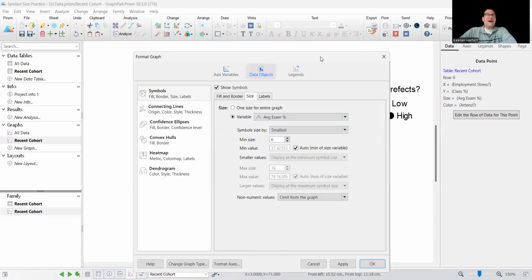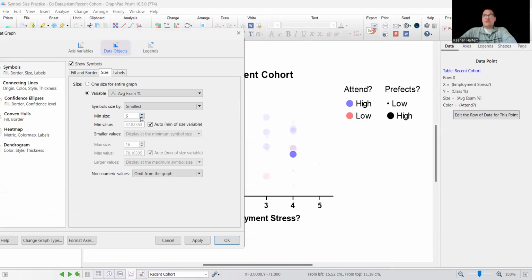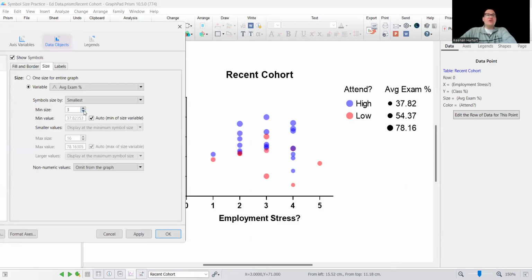And again, we can watch this where I just give it the smallest one and see what happens. So let's go ahead and take that and look right there. It doesn't control it as much as I'd want. It doesn't show that spread that I like. See how the setup is a little smaller, and that's okay when you want really subtle changes. I like the bigger changes. I want the smallest to largest to really pop on there.